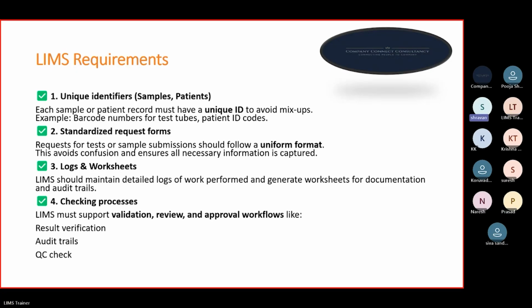Sir, when it comes to LIMS in IT companies, we have only two departments. One is support, where tickets are raised and issues need a technical touch, and the secondary is master data creation. So these two departments are there as of now in the IT industry. Again, as a LIMS consultant, you will also be responsible for implementation.